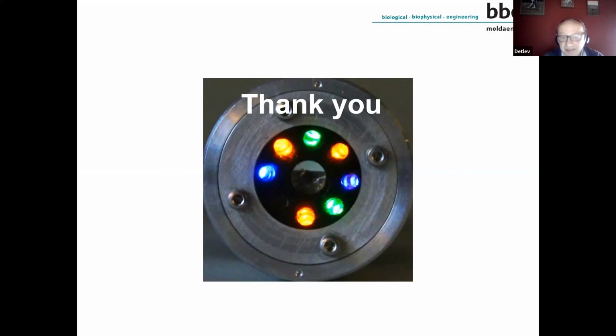But in reality, you can say that there might be a high probability that there can be some biotoxin inside. The fluorometric device does not show anything of the biotoxin itself. At the moment, it's not possible to have a method to determine the biotoxins in real time and in situ. So therefore, the AlgaeTorch is a helpful tool to indicate and, for example, react with a warning note that there might be some biotoxin inside, but the answer comes later from the lab.